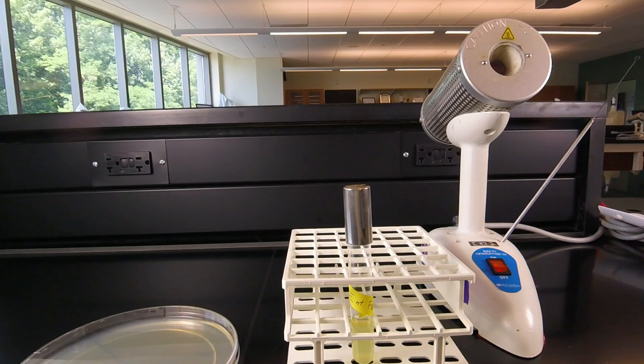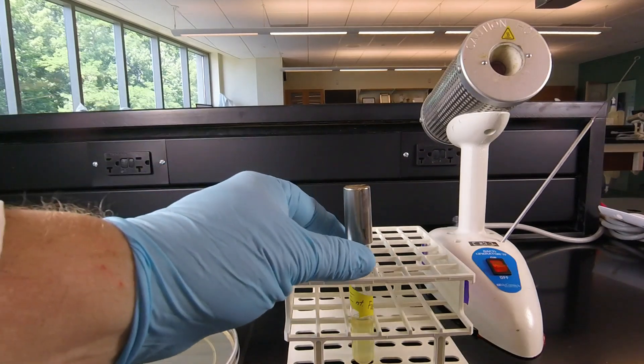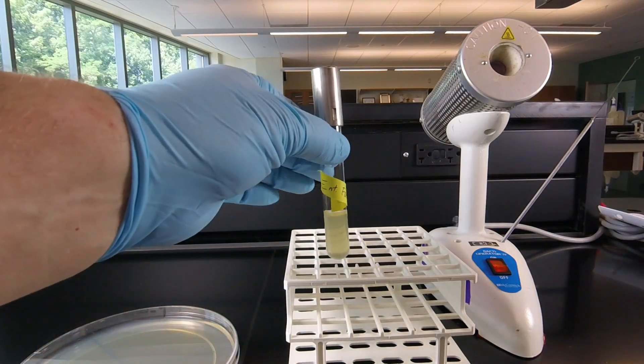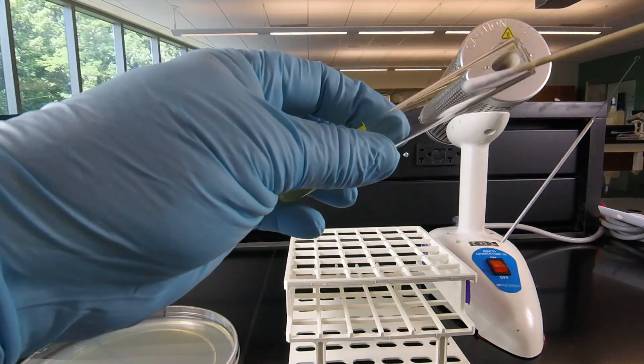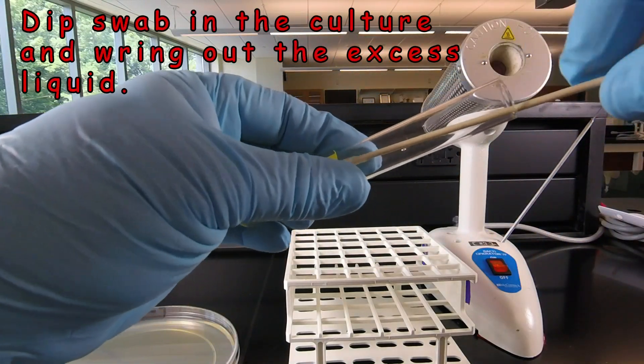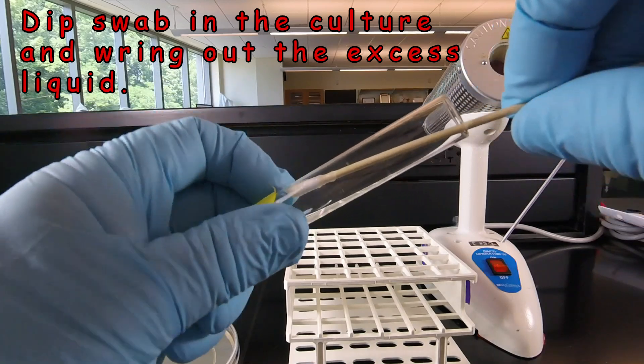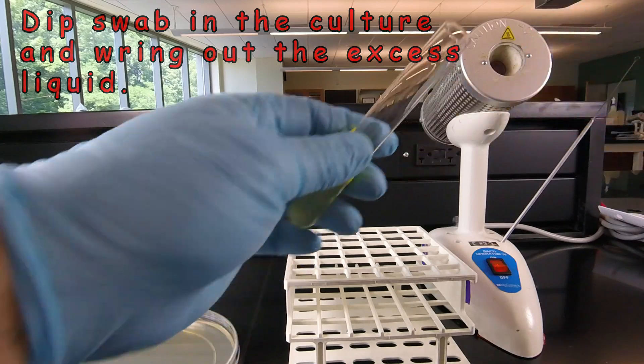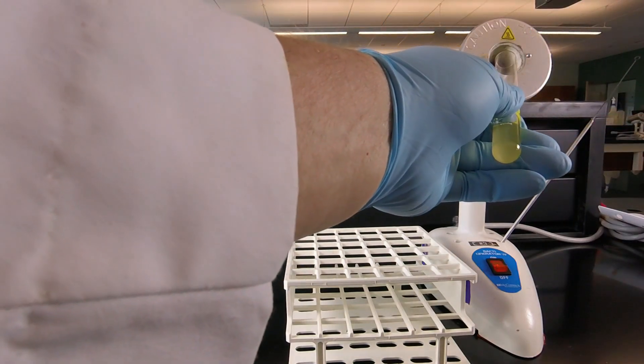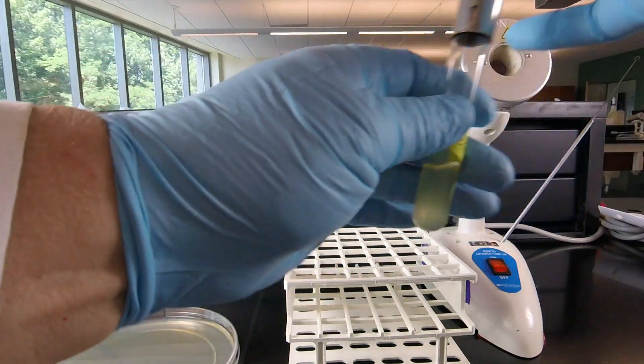So we're going to be using a swab for this. We're going to remove the inoculum by flaming the tube, putting a swab in, then we're going to wring the swab out against the inside of the tube to get rid of excess liquid, flame the tube, and replace the cap.